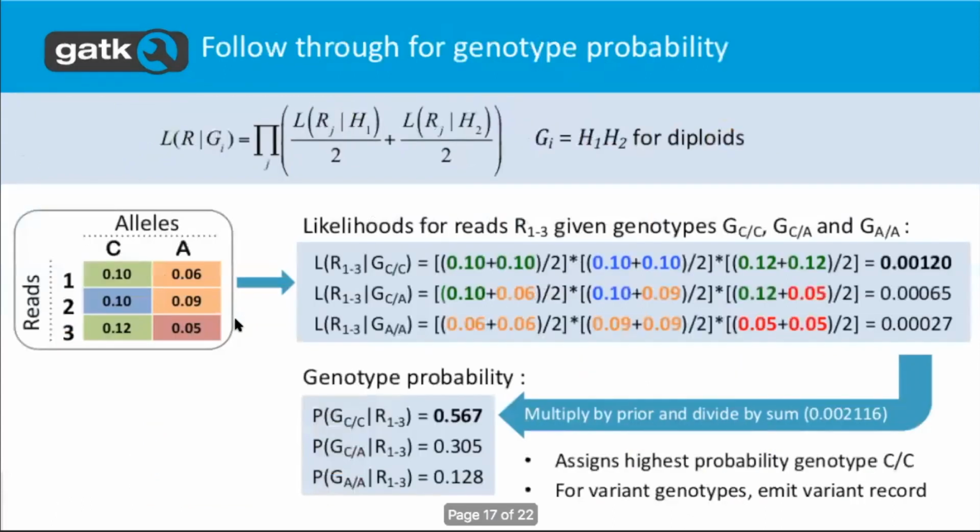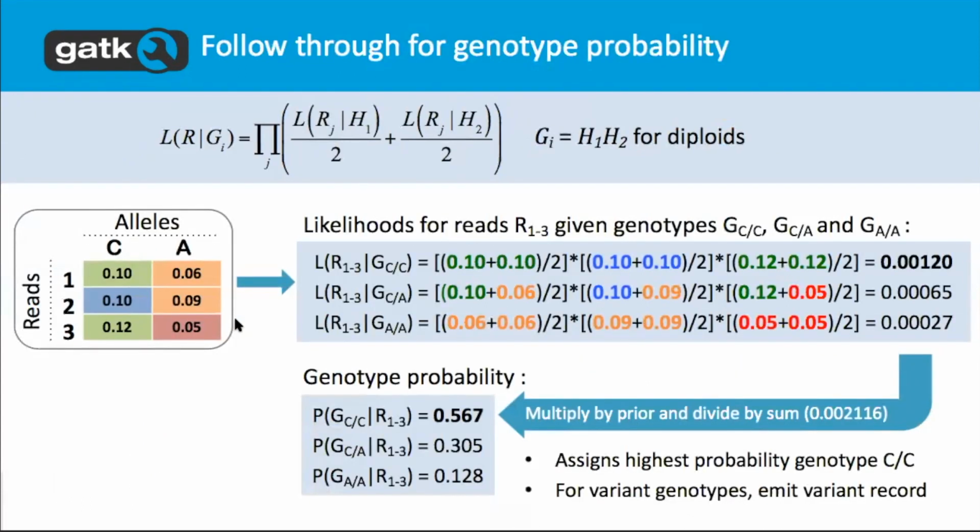Okay. So at this point, we have numbers that we derive this way. This is just in practice what it looks like if you were to write out the numbers involved. We're actually using numbers here that are unrealistically large. These likelihoods would normally be much smaller numbers, and there would be a lot more of them, because we're looking at the support for each read.